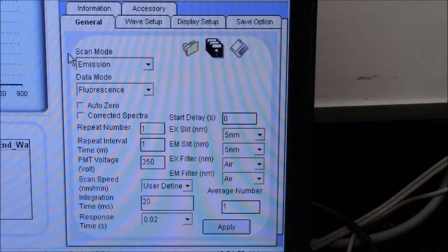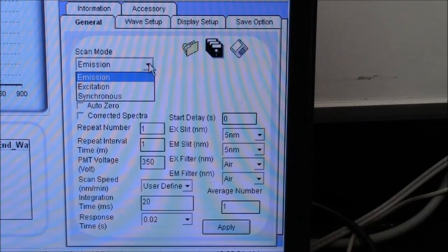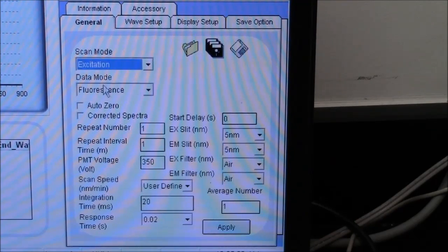Typically, the scan mode that you will be using is emission. This means we're looking at the colors of emitted light. We're looking at the spectrum of emitted light. You could, although, choose excitation. You're saying, I want to decide which wavelengths excite the molecule. I will leave this on emission.